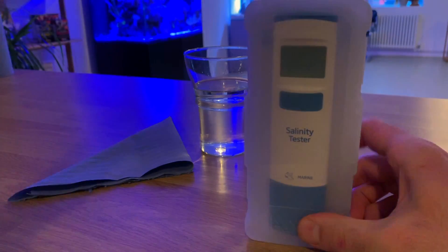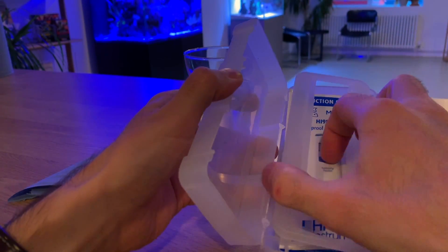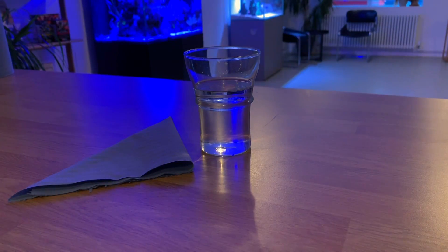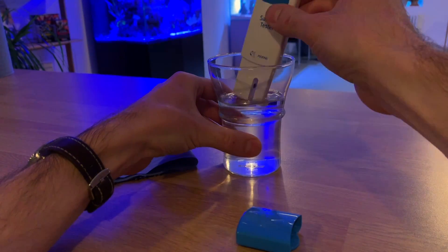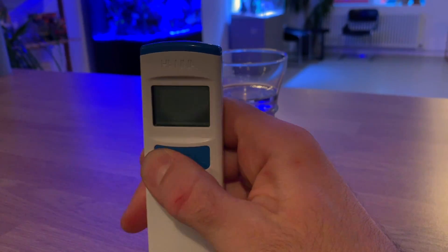Here we have the HANA salinity tester. As you can see, it comes in a really handy plastic container for storage when not in use. You also get the instruction manual and some calibration solution. HANA advise that when first out of the box, the unit is rinsed in RODI water. On the unit you'll see there are two buttons: the power button and the calibration button.